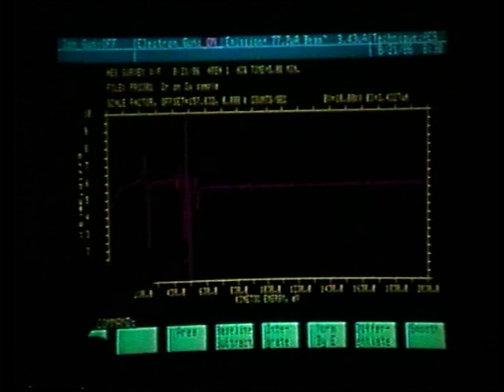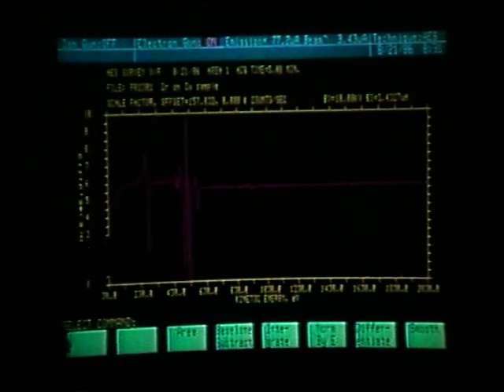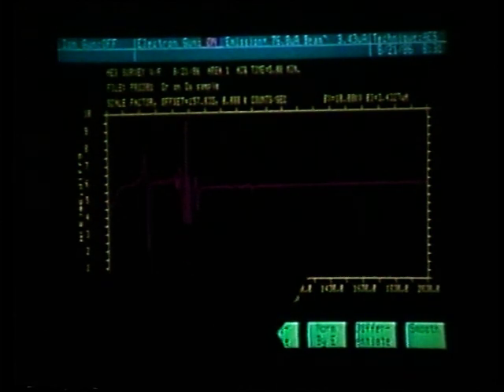Once again, we see the chromium and oxygen present. We see a smaller amount of copper than we saw on the first area. We also see carbon, possibly an indication of sulfur being present, and also possibly some nitrogen present. Very, very low amounts, probably only surface contamination. We do not see any evidence of the silicon present.